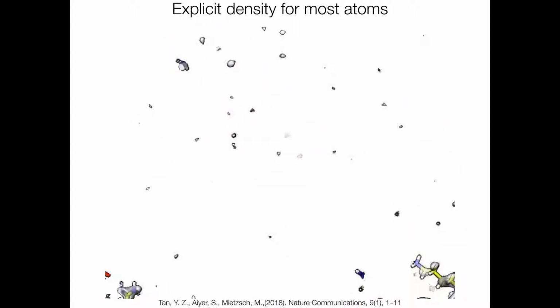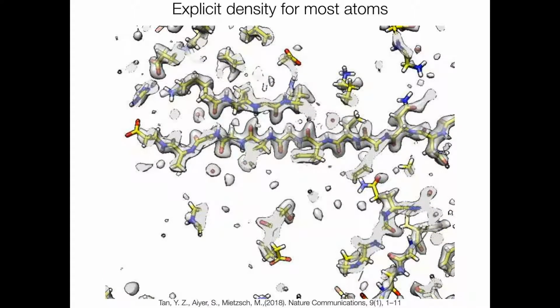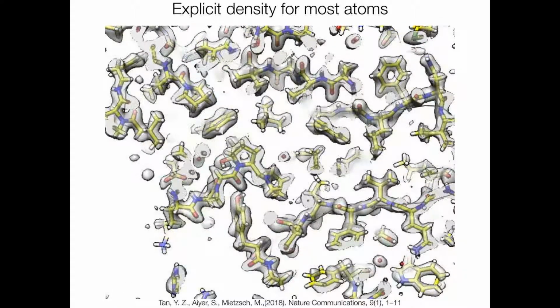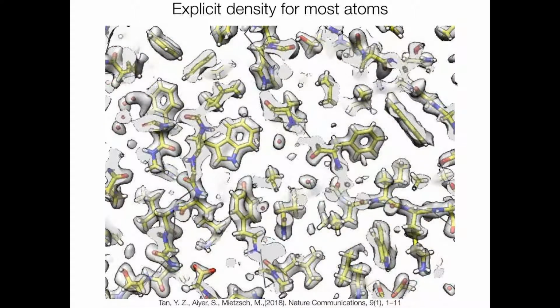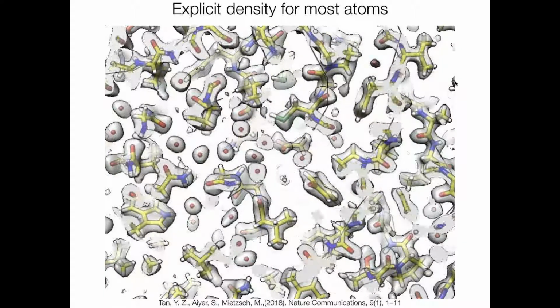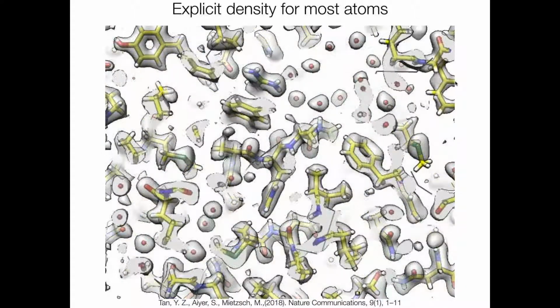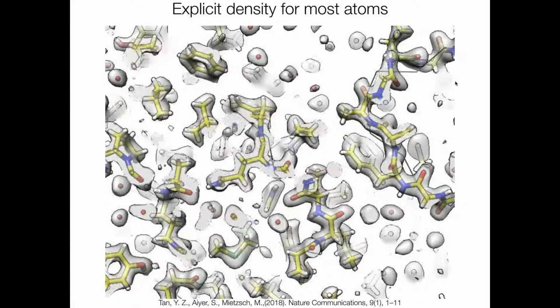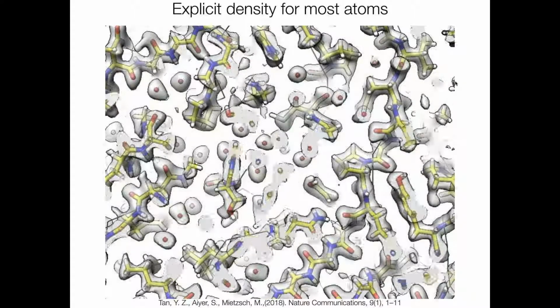How large does the structural difference have to be for you to be able to classify them out? You could have a large domain movement, which might be easily separable, versus something like a rotameric state. If you did a larger group of classification and then had a fuzzier area, you might try to separate those out into different phenylalanine rotamers or something. Yeah, it's a very good point, and we're not at the point where we can classify out individual rotameric states, at least not. But maybe. I hope so.